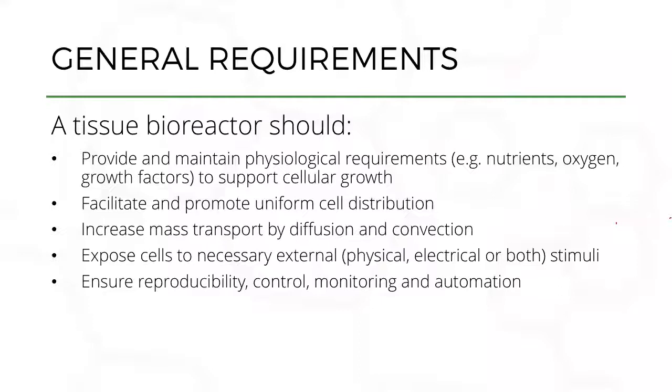The next one to think about, along the lines of nutrient requirements, is how can we increase mass transport? With the classic 2D cultures, you're very much limited by diffusion. Because of the way the culture systems are designed or set up, many of the cellular constructs in 3D are limited by the amount of diffusion that nutrients can flow inside the scaffold, right?